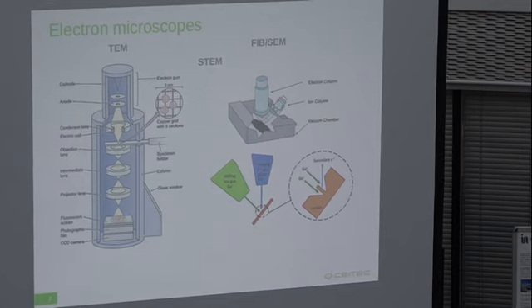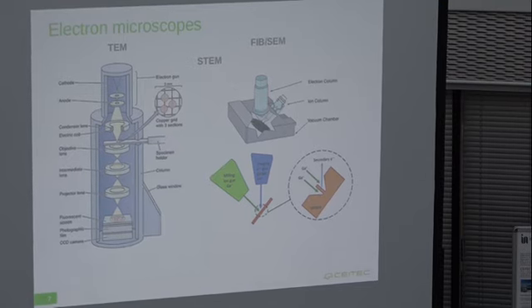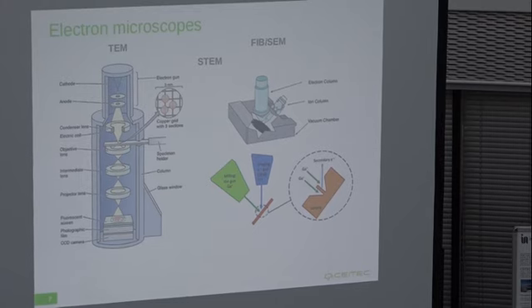What's more, there is also yet another microscope that you can include into your scanning electron microscope, and that is a source of ions. So instead of illuminating the sample with electrons, you can, for instance, use gallium ions to image the surface of your specimen. The gallium will work the same way. Of course, it will generate secondary electrons. It will also generate secondary ions.